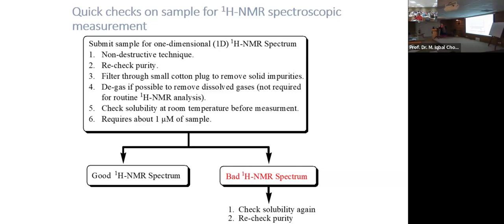You have to wait and see the effect. You decrease the temperature by 1 degree Kelvin and then wait. Everything needs to be stabilized. As soon as you decrease, there is a shift, and you can monitor and measure it. When we take you to the NMR lab, we will show you how temperature affects the recording. We cannot record anything then, because that is not the real environment. Everything has to be stable, then you record your NMR.